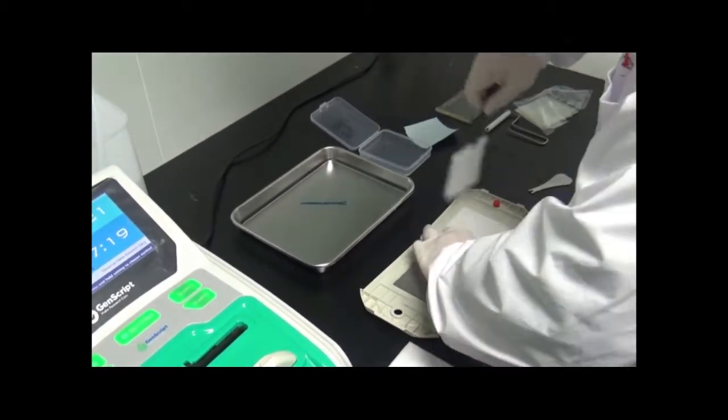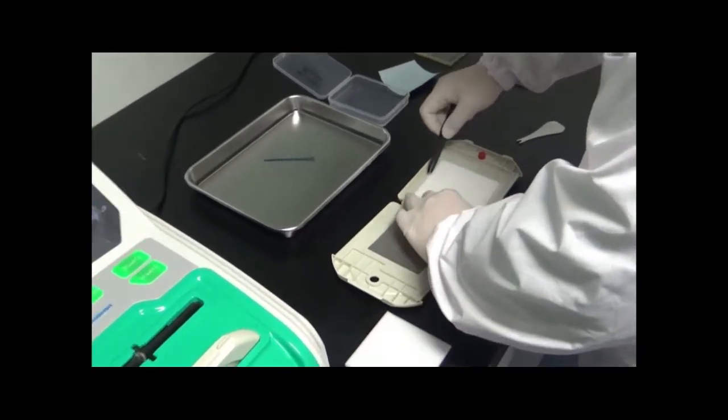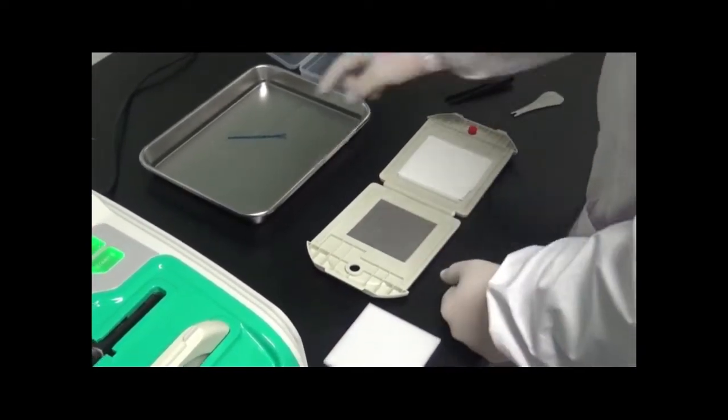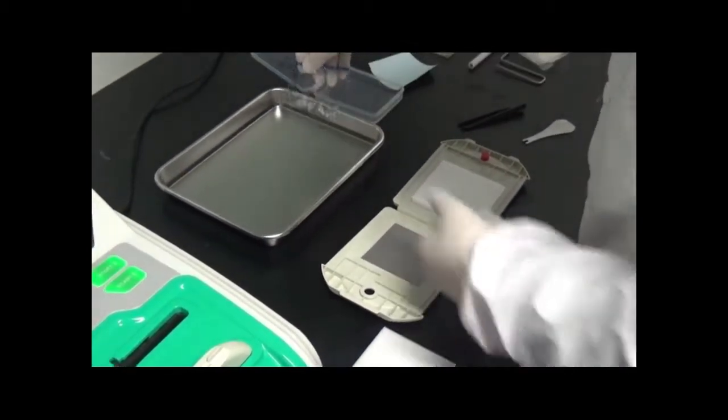Gently pick up the membrane with forceps and place it on top of the dry sponge. Now pick up the gel from the water tray and place it on top of the membrane.